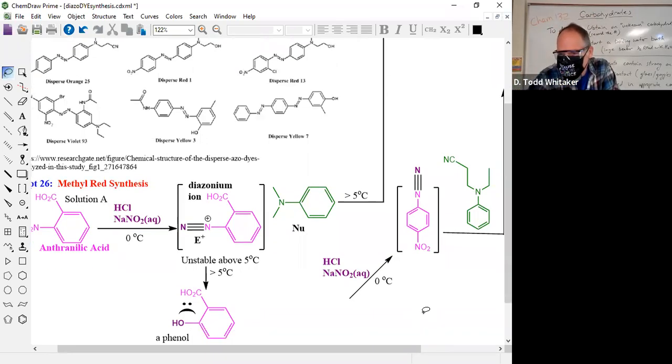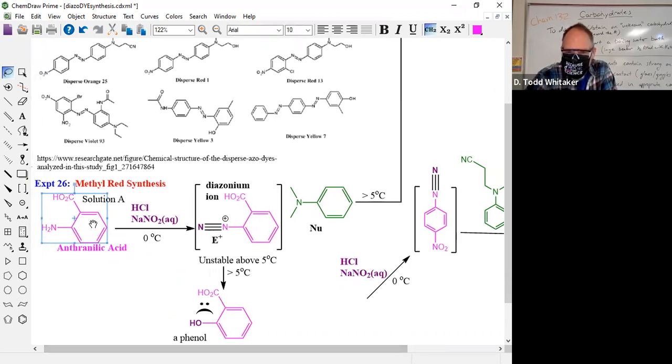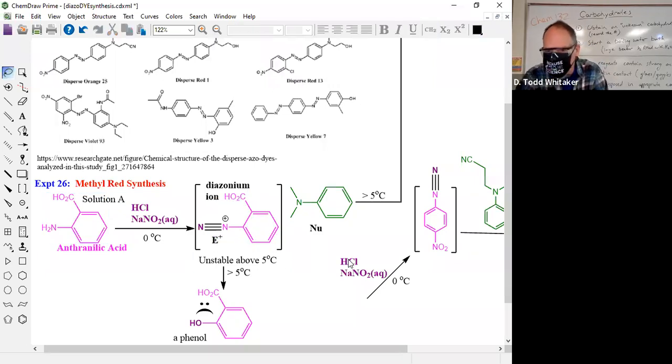Okay. All right. Yeah, what goes before this arrow? I got the purple for this thing. I don't have any of the pink. Hey, this pink became this pink. You see it? What's the only difference? NH2 instead of N-triple-N. Got it? NH2 instead of N-triple-N. I'm going to go find the pink, grab it.